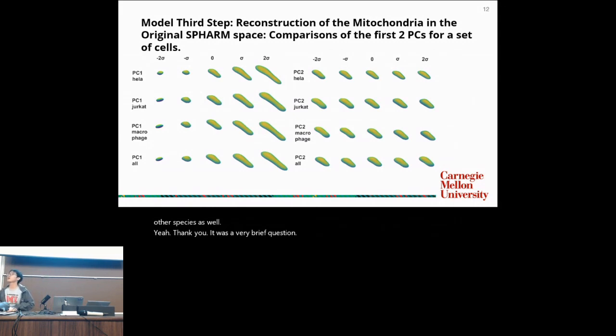Very brief question, sorry if I missed this. Are you segmenting the individual mitochondria in the beginning? That's your first step. Oh, yeah. Actually, we just applied an existing segmentation algorithm provided by the dataset. The dataset provides a segmentation algorithm to help us directly segment each individual organelle.